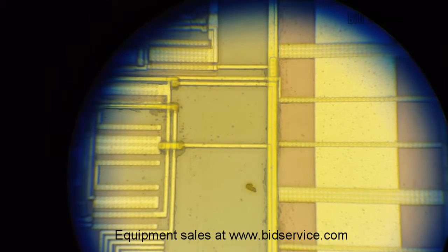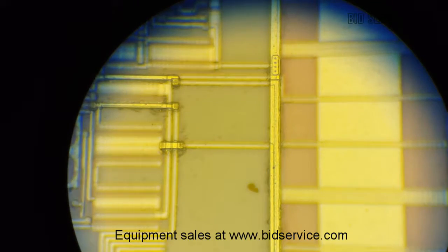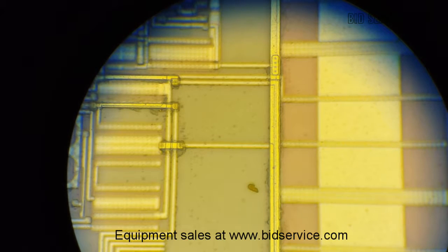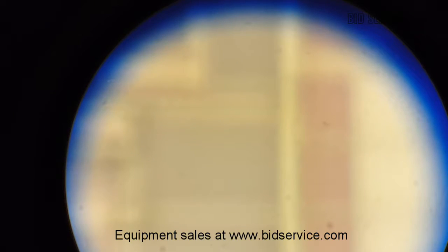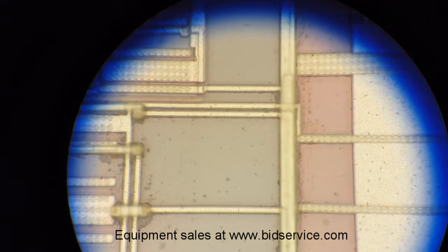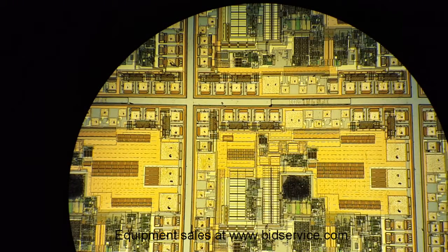Here's the 100x. Let me give it just a tiny bit of focus adjustment. And here's the 150x — 150x requires a tad of fine adjustment. That's the camera searching there. And back down to 5x with no focus adjustment.